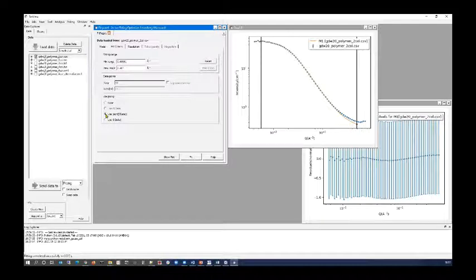And the reason it's not perfect is that at low Q, where your intensities are highest, you're going to have big uncertainty, but at high Q, where your intensities are smallest, you'll have small uncertainty. And if you look at a real experimental data set, that's not usually how the uncertainties are distributed. But as I say, this is a kind of a get out of jail free card.